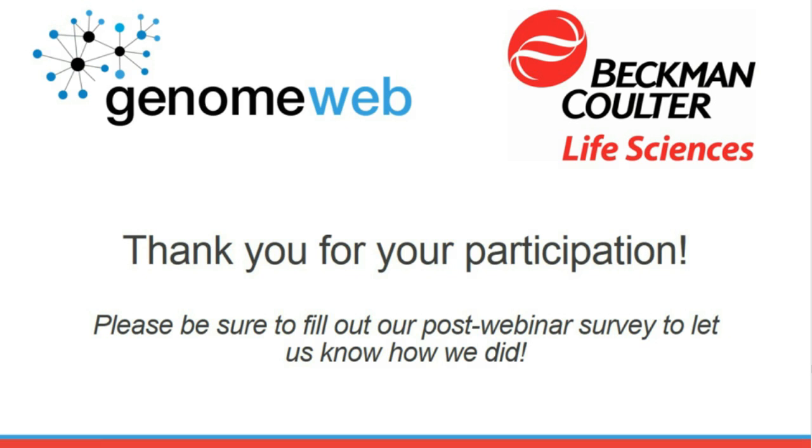That's a great question. The Echo 525 dispenses 25 nanoliter droplets really fast, a couple hundred of them in a second. And we have customers going up to 5 or 10 microliters. We recommend keeping the volumes low for the sake of speed, but because of the accuracy and precision they get, some people have been doing 96 well plates at 5 and 10 microliters. But again, my recommendation would be keeping it below 5 microliters.